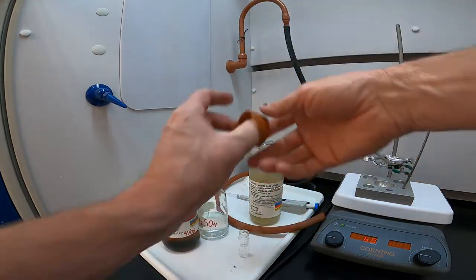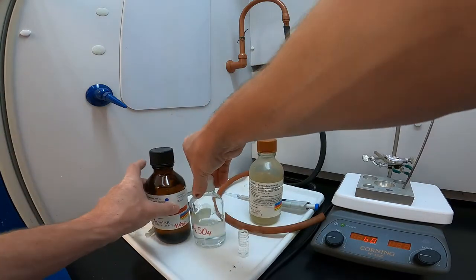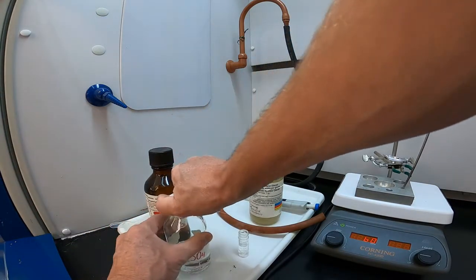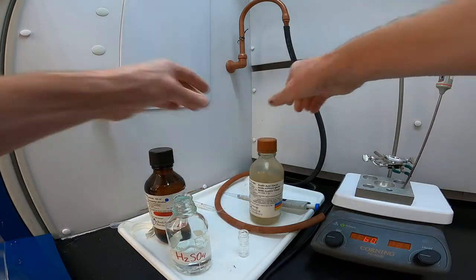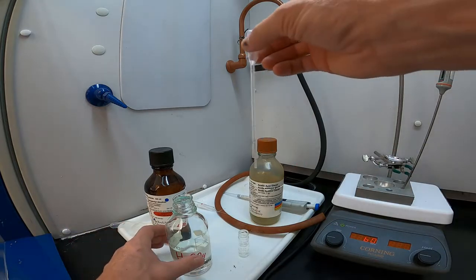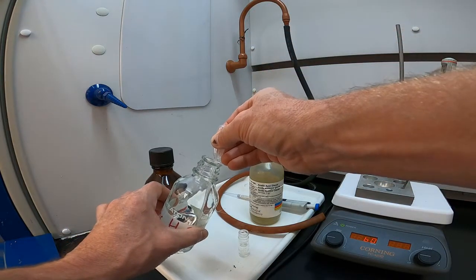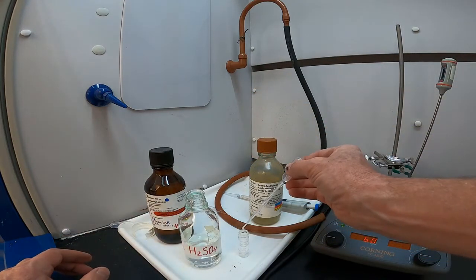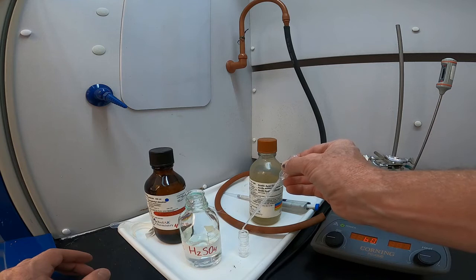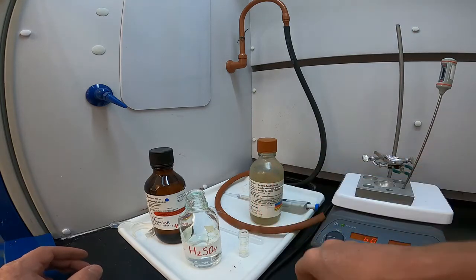And then lastly, we'll add sulfuric acid that catalyzes the reaction to proceed. So our two reactants, isopentyl alcohol and acetic acid, will combine to make the isopentyl acetate. So sulfuric acid, all we need now is just about 4 drops. There we go. So all of our reactants are set.